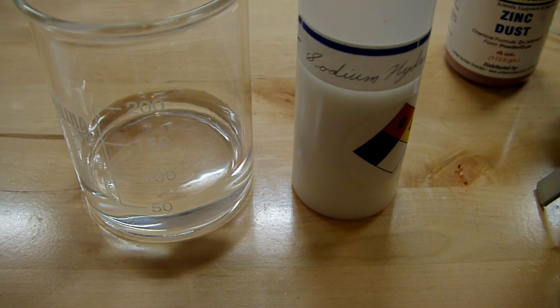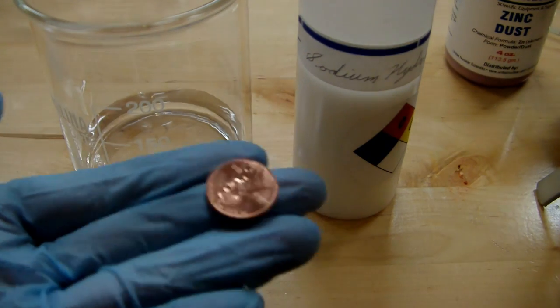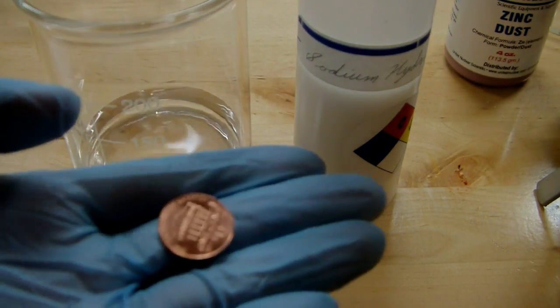Today I'm going to be doing some penny alchemy, which is a relatively common chemistry demonstration where we take everyday copper pennies and change them into silver and gold.